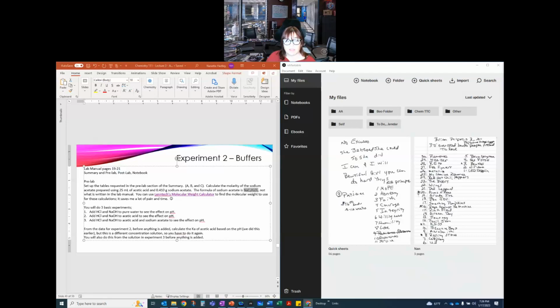I would expect that you would see different things in pure water than you would in the acetic acid, and different things in the acetic acid and sodium acetate solution. Now, acetic acid and sodium acetate is a buffer, so I would expect there to be limited change in the pH from that. Now, from the data, before anything is added, you want to calculate the Ka of acetic acid based on the pH.